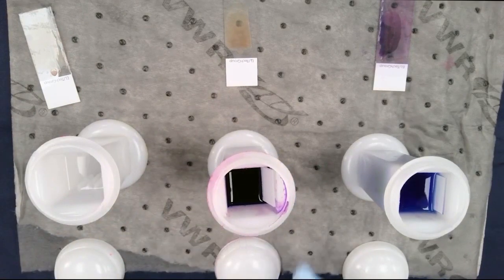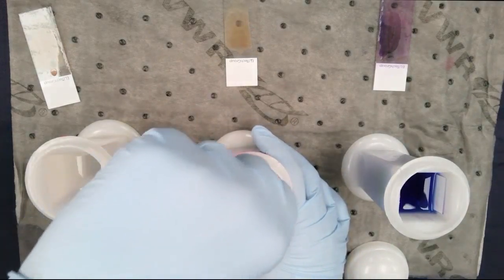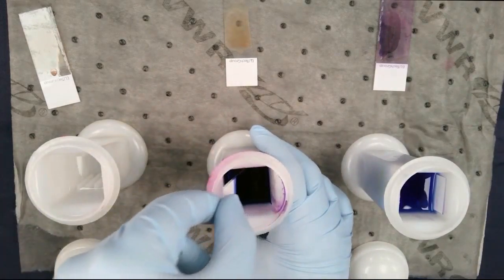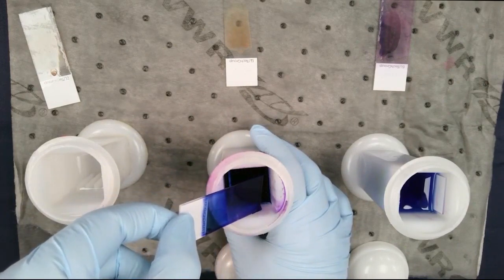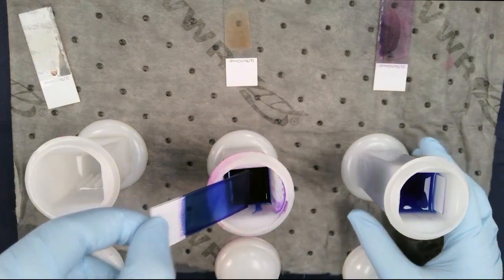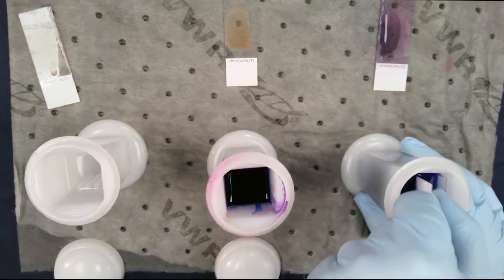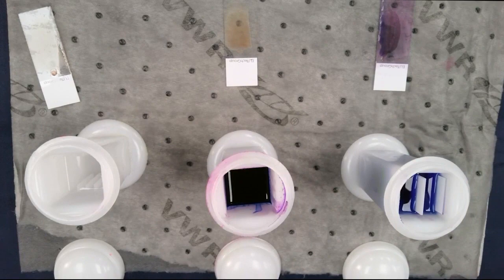Right now we are performing an example hand staining protocol with Elitech reagents, but other vendors' procedures and timings may be different. After staining, we're going to allow that stain to drain off as much as possible to prevent carryover. And then we're going to transfer the slide into our buffer reagent for rinsing. The buffer reagent is normally colorless, but is quickly colored bluish when rinsing the stain off and should be replaced after every couple of stain procedures.